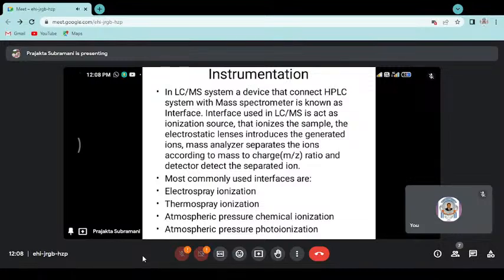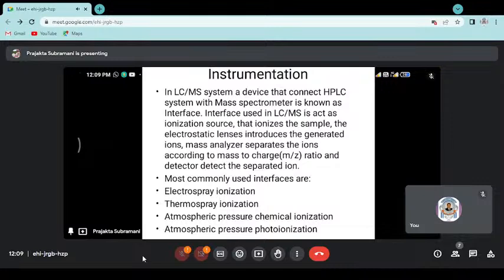By using a capillary, fine droplets are produced, and then by chemical ionization there is a production of primary ions. APCI, atmospheric pressure chemical ionization, vaporizes the solvent and sample molecules by spraying the sample solution into a heater using N2 gas. So nitrogen gas is used for desolvation of the sample solution.